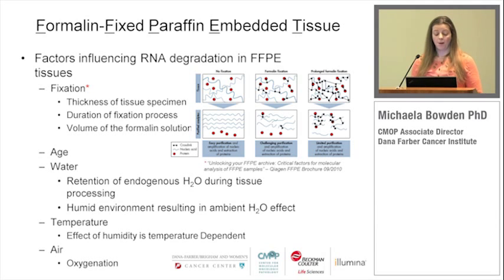So most of them have been stored in wildly different conditions, different humidities, and therefore when we go and extract material, the range of degradation that we see is not something that we can predict. It's random. And sometimes it's linked to age, but not necessarily. A lot of the cohorts we get come from different sites, so how they were stored at those sites has a huge impact.